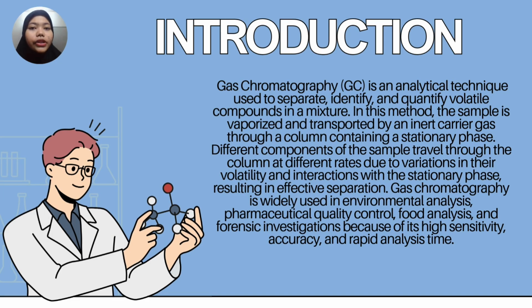Hi, my name is Nur Atika Syairah binti Nazri. I will present the introduction of gas chromatography. Gas chromatography is an analytical technique used to separate, identify, and quantify volatile compounds in a mixture. In this method, the sample is vaporized and transported by an inert carrier gas through a column containing a stationary phase. Different components of the sample travel through the column at different rates due to variation in their volatility and interaction with the stationary phase, resulting in effective separation.